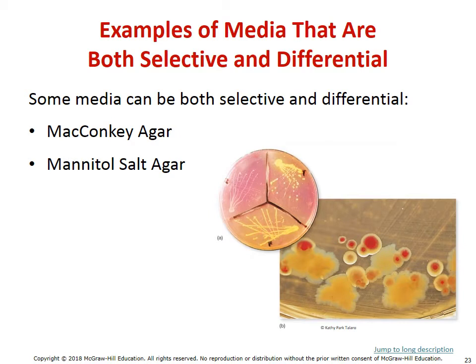Interestingly enough, what this test primarily looks for is staphylococcus. Staph readily grows on your skin, which is usually pretty salty, and as a result can readily grow on this agar. But there are two different types of staph that we're interested in here: the Staph aureus and the Staph epi. The big difference between Staph epi and aureus is aureus can ferment the mannitol, making again the yellow appearance, while the epi cannot, resulting in still that pink of the mannitol salt agar.